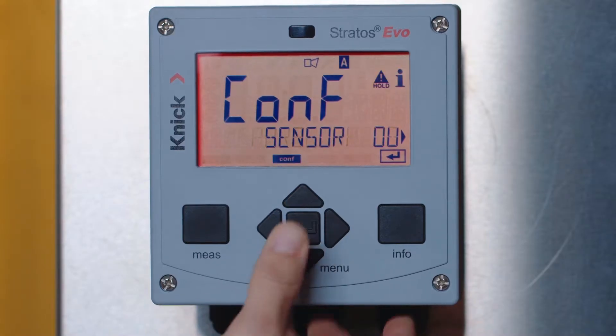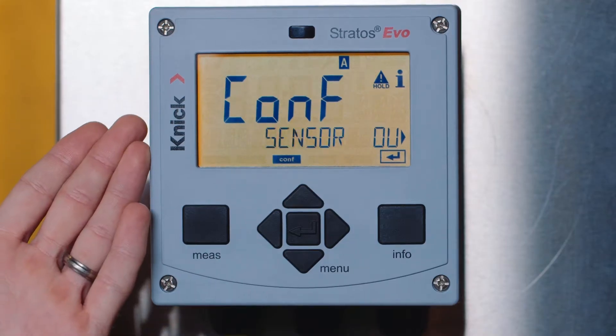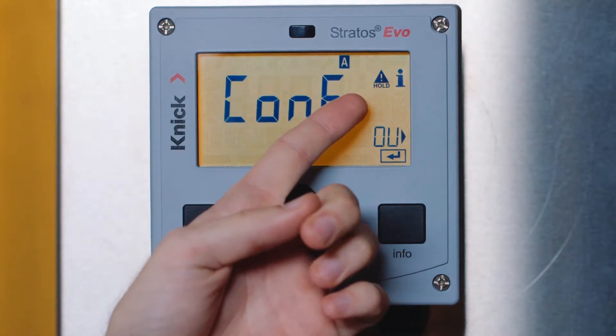We're going to configure parameter set A. You'll notice once we enter the parameter set, the transmitter enters a hold mode. This is indicated by the backlit display changing to yellow and the hold icon on the screen. Hold mode ensures that your control system does not receive erroneous values while you're configuring the transmitter.